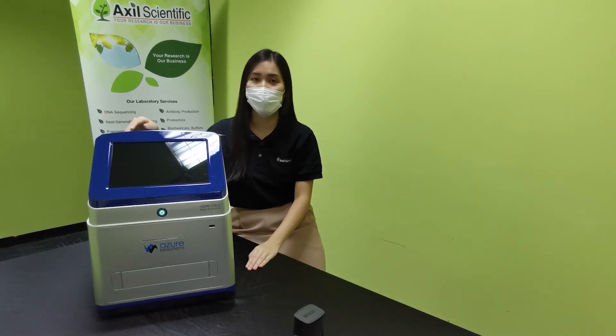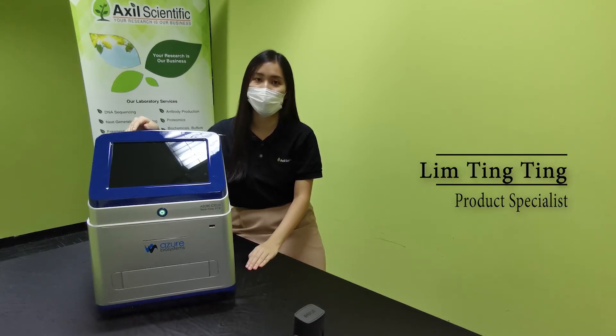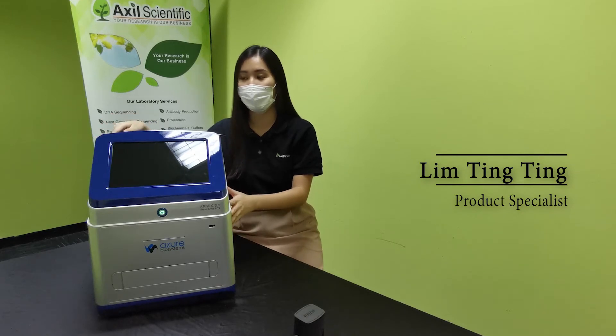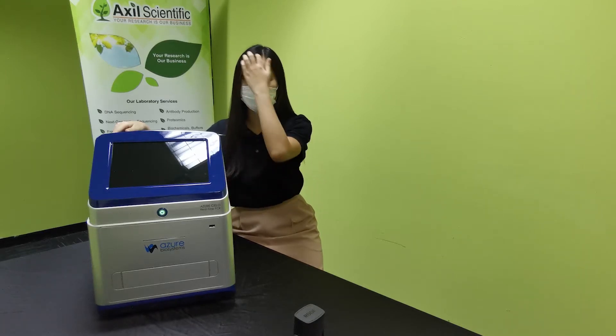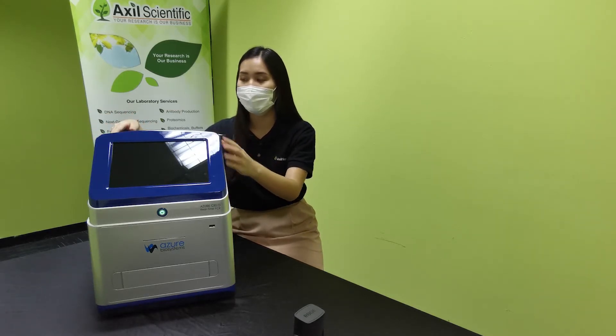Hi everyone, welcome to our demo session of the Azul CLO qPCR system, or real-time PCR system. I'm Ting Ting, a product specialist from ExoScientific in Truman Division. What you are seeing here today is our 6-channel qPCR system, Azul CLO 6, capable of multiplexing up to 6 dyes. Today I will show you the operation of this system as well as the software on board.